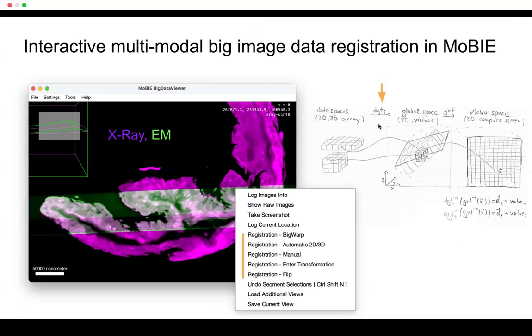And the very nice thing here is that this is fully interactive and works with big image data. And the trick is that the only thing that all of these registration modules touch is this data to global transformation, which is typically for us just an affine transformation. So it's just 12 numbers. And this is getting modified and nothing else. And that means even if you have a terabyte EM volume, all of this is instant. You can just move it around wherever you want because you never touch the data space. You just touch these 12 numbers that map from the data space into the global space. So yeah, very convenient, I think, for interactive registration.